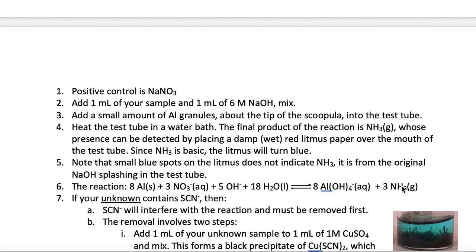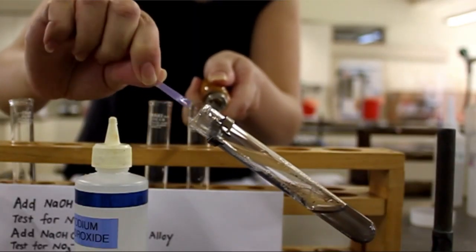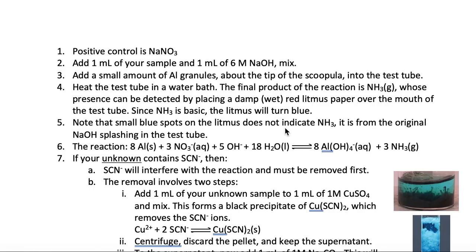Since ammonia is a weak base and it is also a gas, it will evaporate to the top of the test tube and react with the wet litmus and change it to blue. Note that the litmus has to completely change to blue and not just showing small specks of blue. The specks are due to splashes of sodium hydroxide and it's a false positive. So you want to make sure that the whole litmus turns blue.